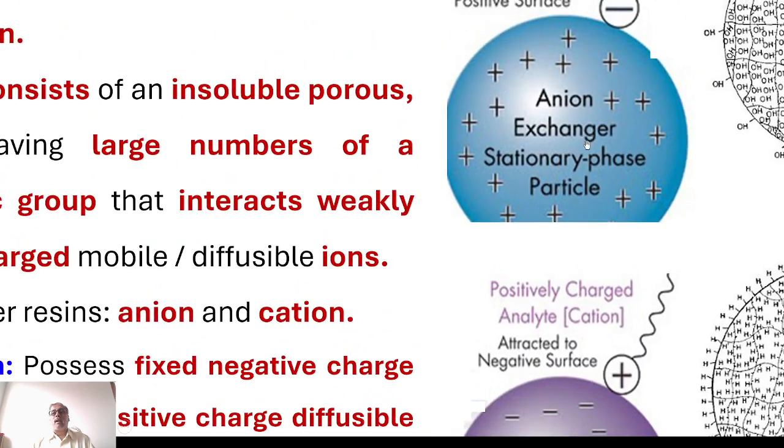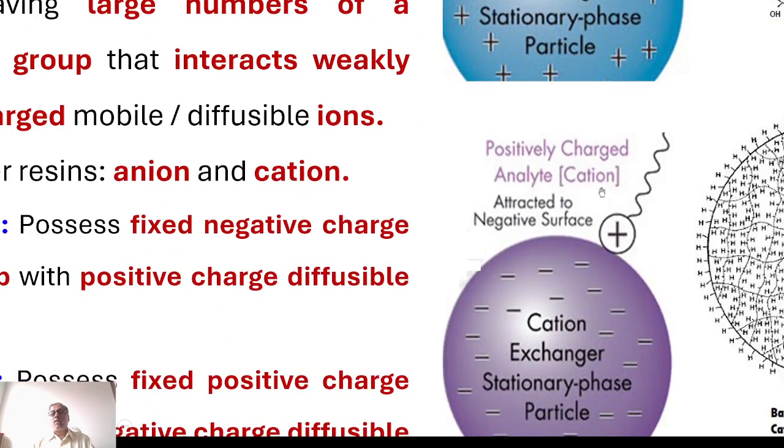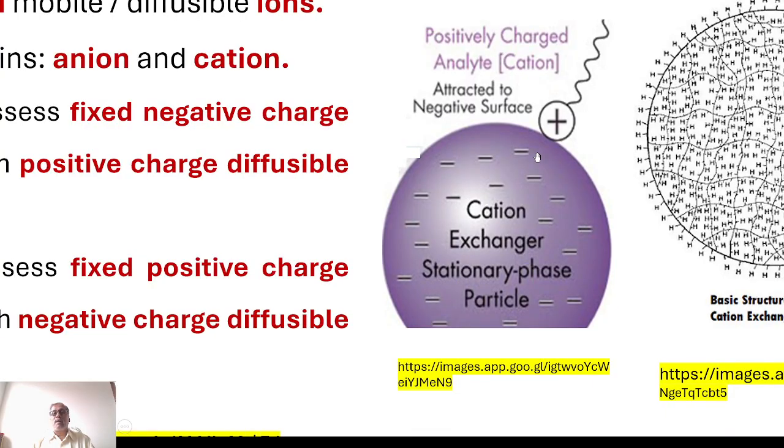So if you use anion exchanger, you can effectively separate or purify anion macromolecules or anion molecules. If you use cation exchanger, you can effectively separate or purify cations. So weight doesn't matter. Here the separation or purification is not happening due to the weight. Whether the molecule is of very low molecular weight or higher molecular weight, weight is not an influencing factor, only the charge.